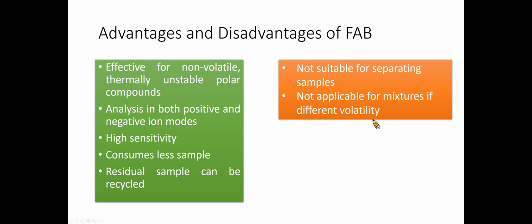For biologically active substances, the residual sample remains active and can be recycled due to the bombardment of the neutral particles used. In addition, the ionization probability and detection sensitivity of each component in the sample are related to the sample composition. If the energy required for ionization of one component is lower than the other components in the sample, the ionization probability of that component is large.